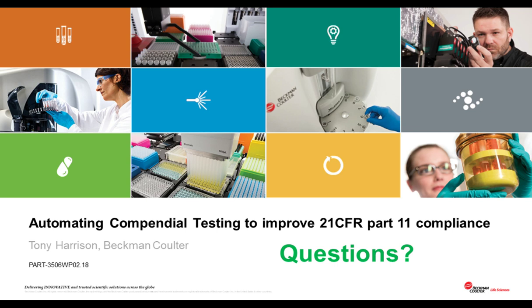It's a good question. In fact, in the 21 CFR Part 11 guidance from the FDA, PDF is one of the recommended file types. They suggest that because you can read PDF on many different platforms, Android, Microsoft, etc. So the idea is you should be able to read that record well into the future. And the way we ensure the integrity of these PDFs is the PAT applies a randomly generated password to each PDF, which secures them and prevents them from being changed.